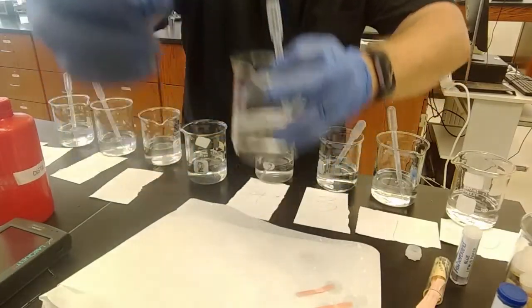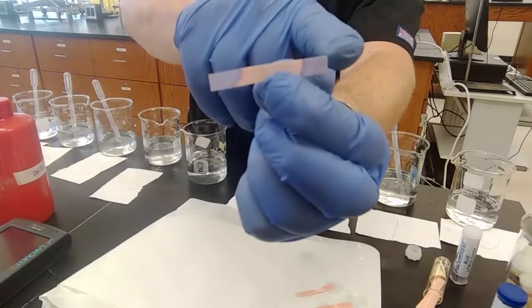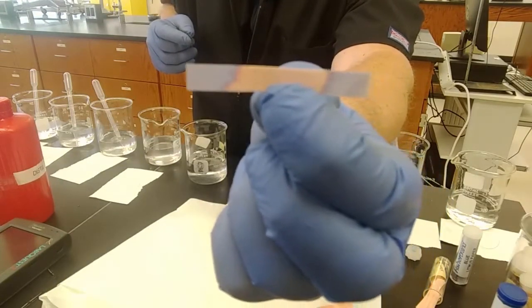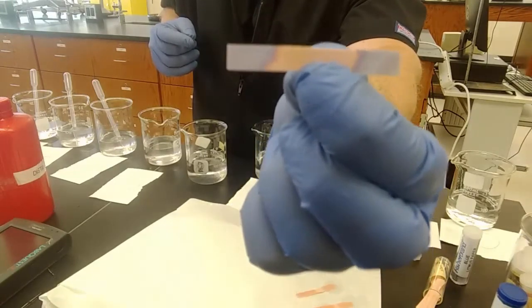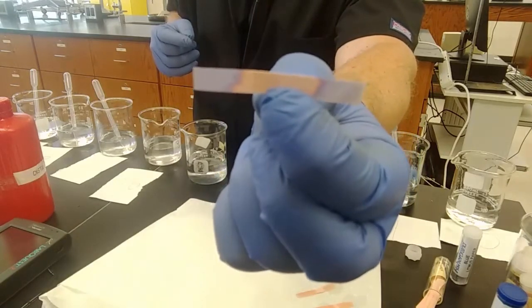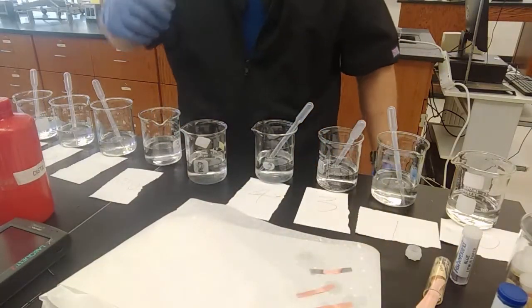Also blue. Now, if I look at the two ends of the paper that I used, this is 14 at this end, 13 at this end. There's no visible difference. Okay? That's not what litmus paper is capable of giving us a difference. It's basic. We know that. 10 and 11, we're expecting basic. According to the pH paper, it's acidic. According to the pH meter, also acidic. Our dilutions appear to have been contaminated.